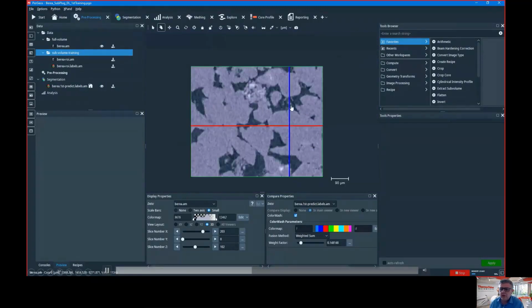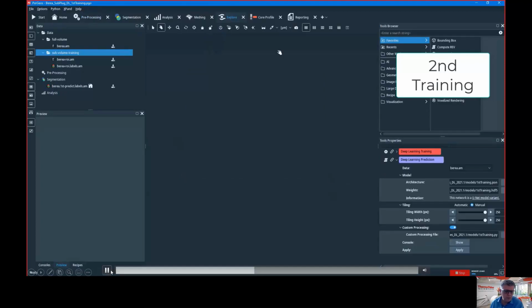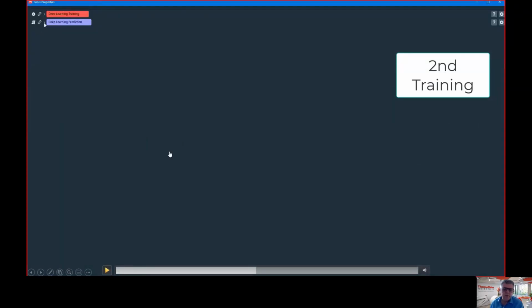You can judge the quality with plenty of different methods. I'm not going to detail. Just to give you some idea, you can compute the porosity and the permeability, this type of thing, on the predicted segmentation to judge if the segmentation is good or not. Because you may know from the lab what the porosity and the permeability are, and so you may do it digitally on the predicted segmentation and compare. This will give you a way to judge if your prediction is good or not, so if your model is good or not.